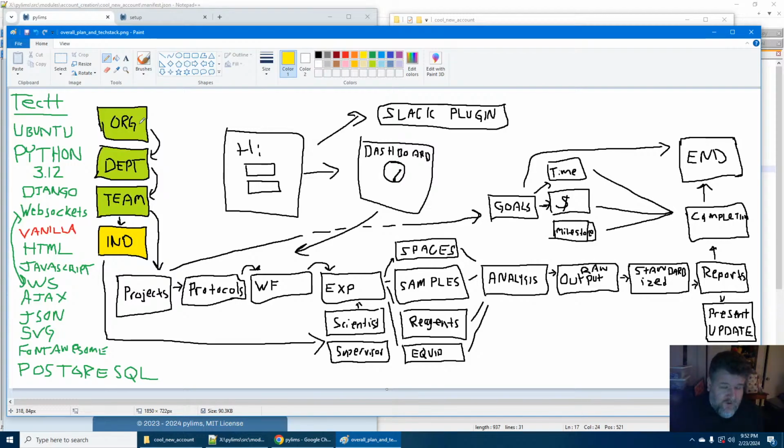As I completed them, I thought maybe I should do this in a different way, but I'm going to continue to keep going, because the whole idea here is I'm just making these default simple modules that can be replaced at any time. I can upgrade them later with a different version or a whole new module to give people more options. Right now they're pretty simple. And for individuals, there's account creation and things like that, but I'll eventually do profiles and dashboards later. So I colored it yellow because it's kind of in there.